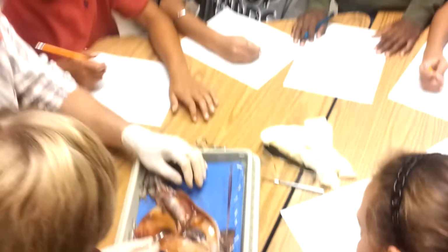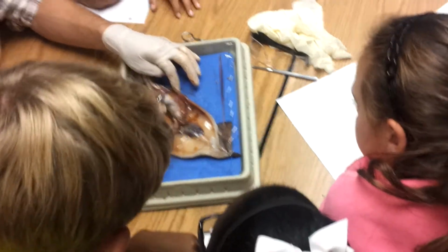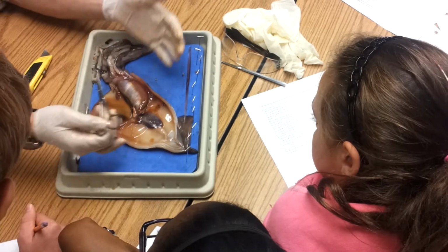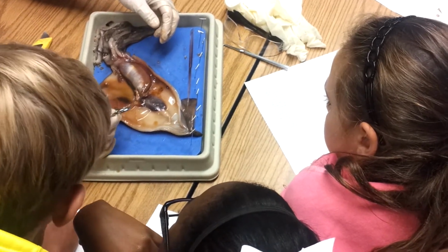This little fleshy thing on the outside here, you see that? This little bug? There's another identical one underneath here. We just can't see it right now. That's the gills. That's how it breathes. So in here, it pumps water in and out, and it goes over the gills, and that's how it breathes.